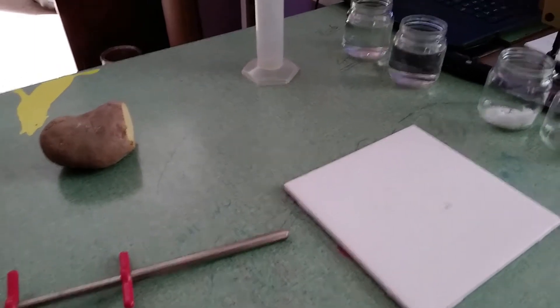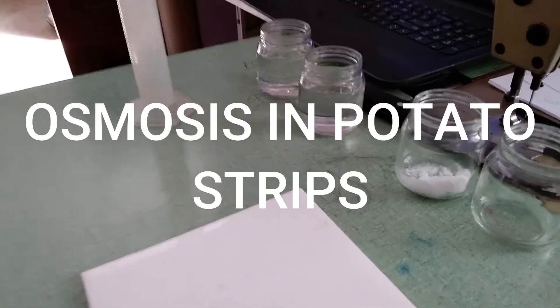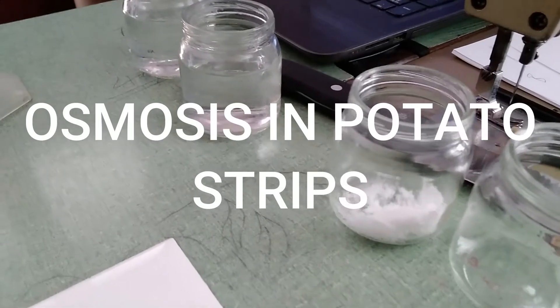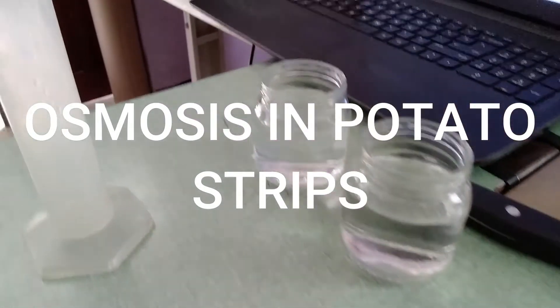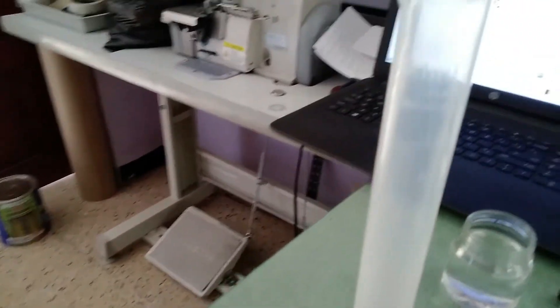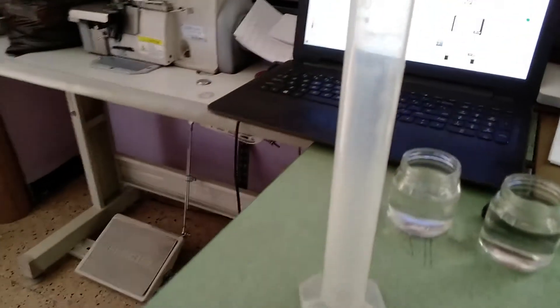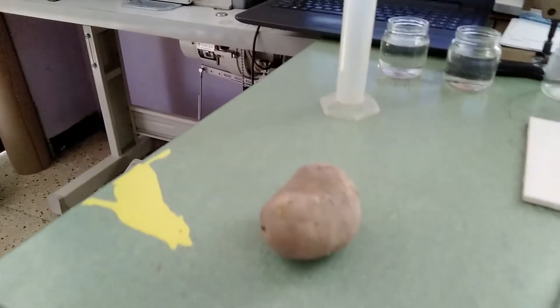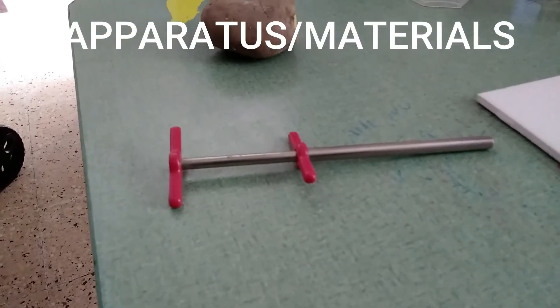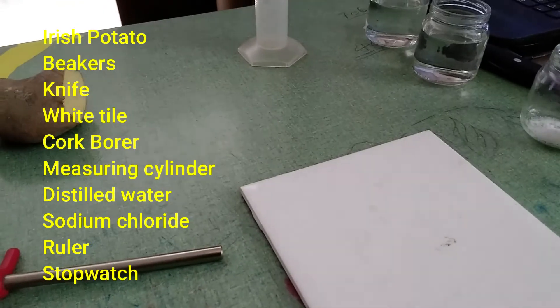We are still at home for COVID but I'm going to be doing this lab. I do not have a balance to measure the salt, but you can see the salt there and those are my little specimen jars. I have measured the water already, but again I will measure the water using this measuring cylinder. We have an Irish potato, the metal core that we will use to get a sample of potato, and a white tile. Let's get started.